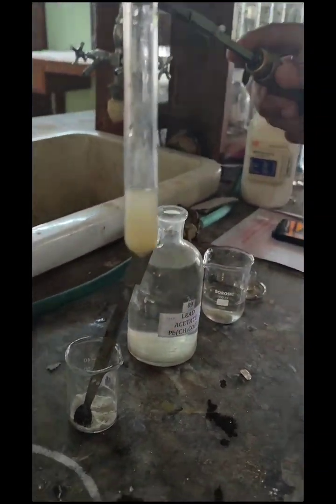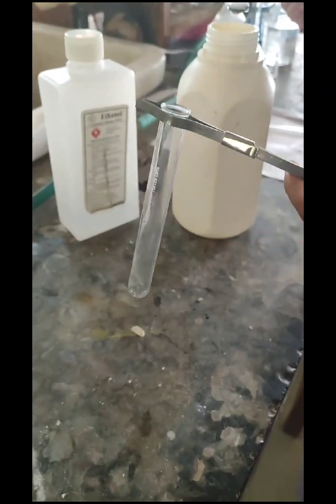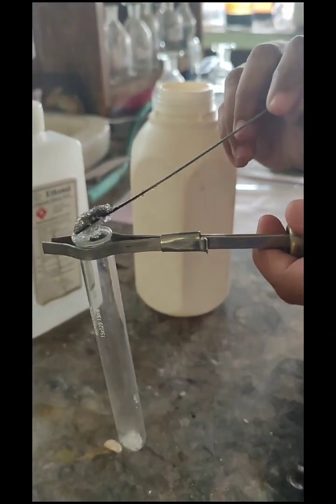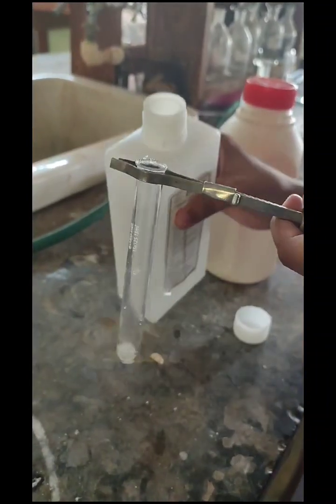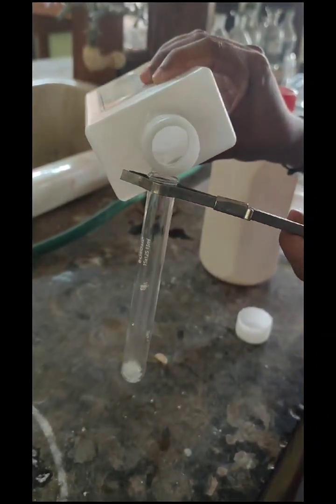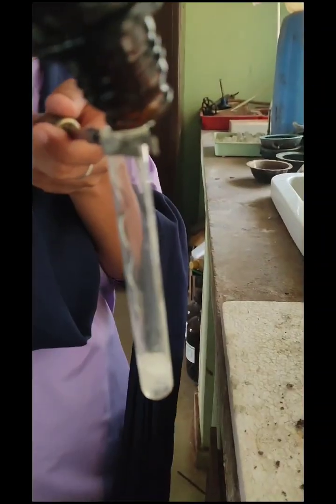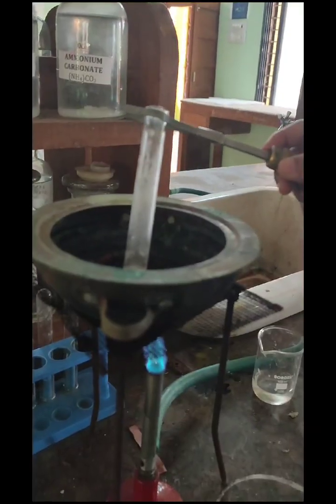Now we are performing the test for acetate. For this, add some mixture in a test tube. Then add some ethanol. Add some concentrated H2SO4 to this. Heat the solution for 10 minutes.